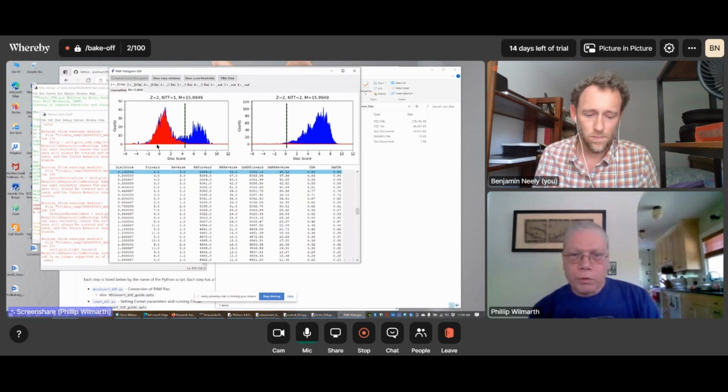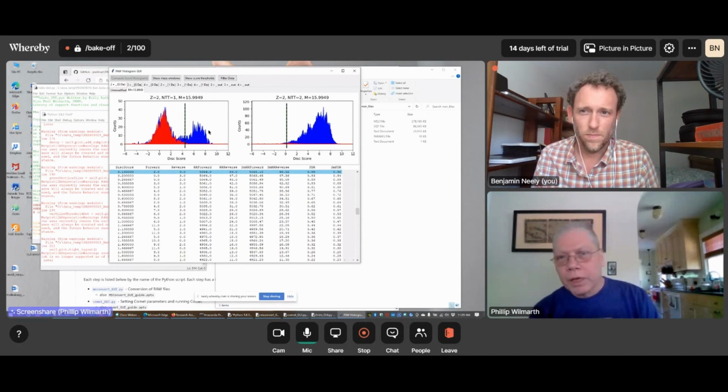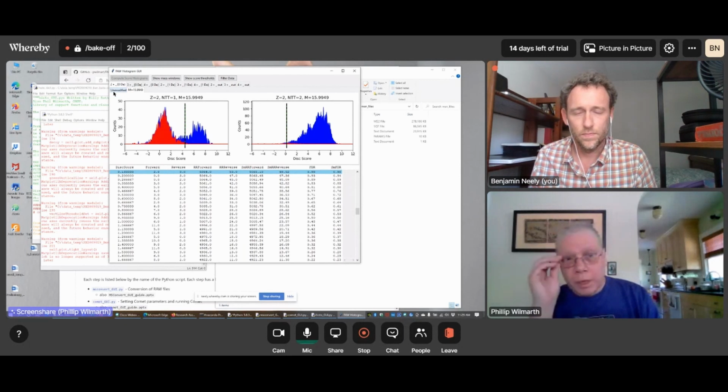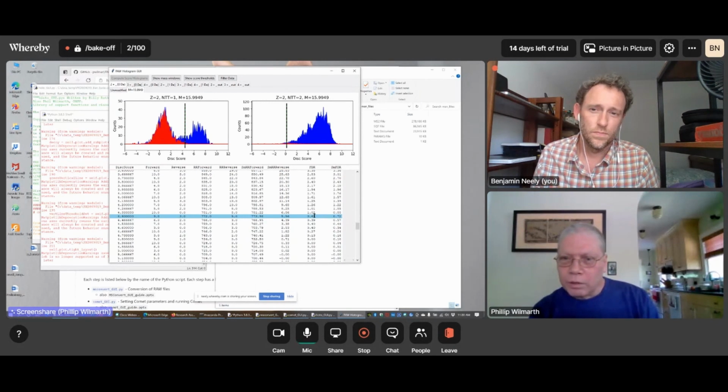peptides as well. Their score distributions are smaller, but they're pretty much the same shape and locations as we have for the unmodified peptides. And we again have thresholds set by default here. We can go in and tweak these if we really want to, or change the FDR level. Like here, we can see that we're setting it just under 1% FDR is where the cutoff was.